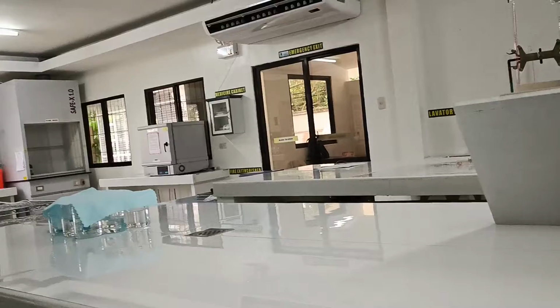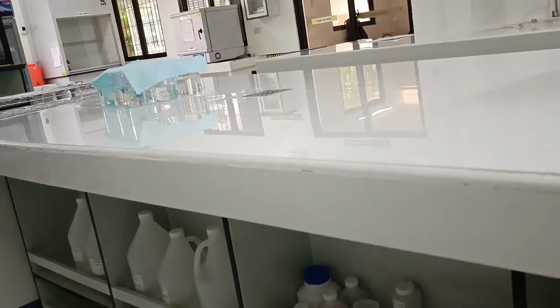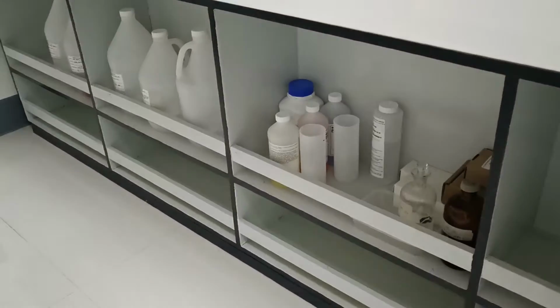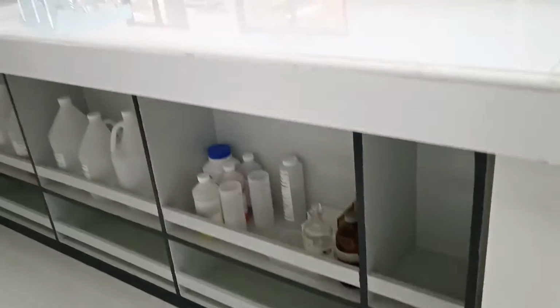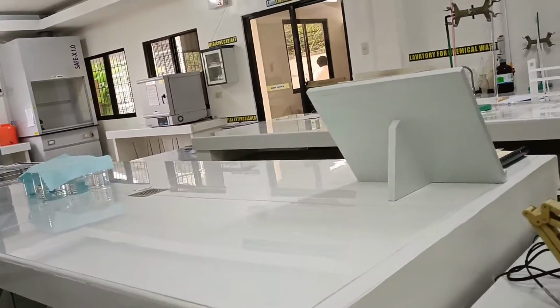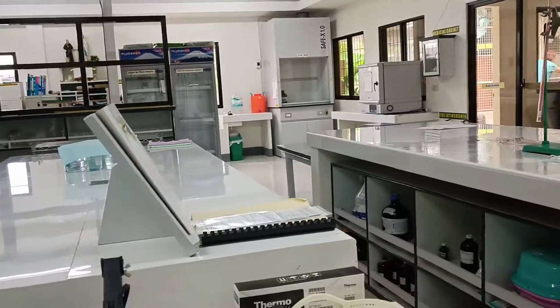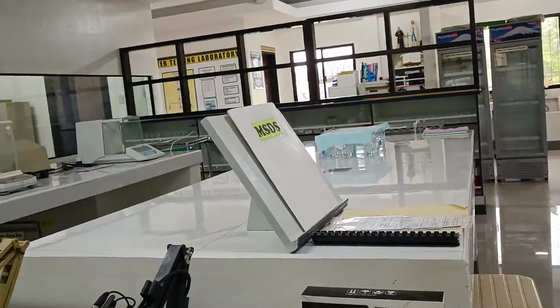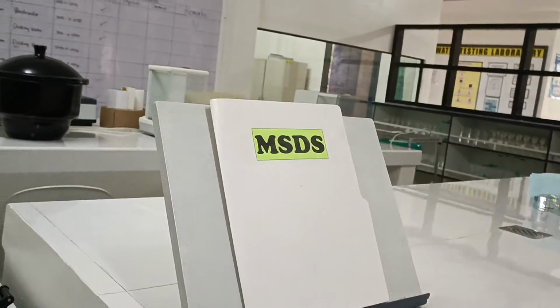Down below are cabinets which hold reagents. A copy of the MSDS.